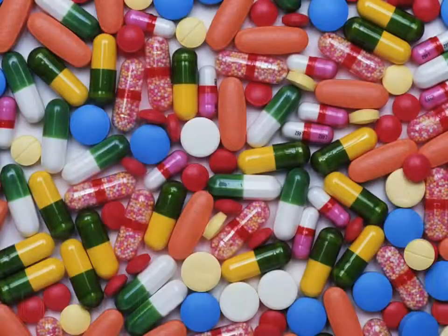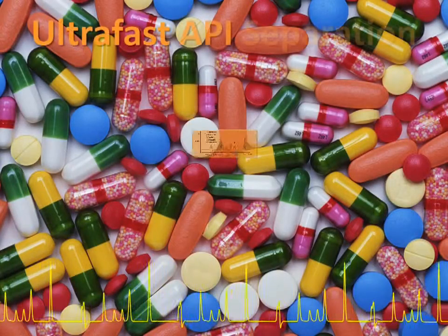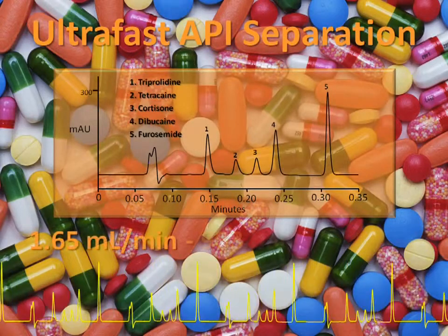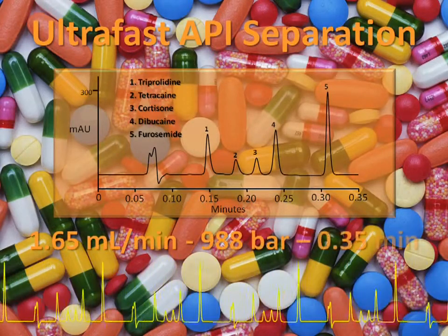A good example of the power offered by the RSLC is this separation of 5 active pharmaceutical ingredients in only 24 seconds.